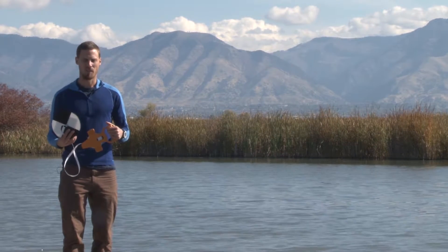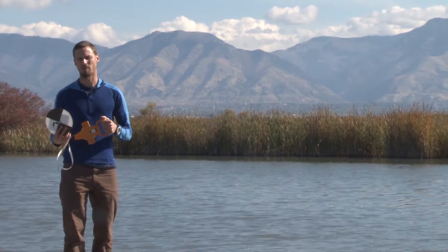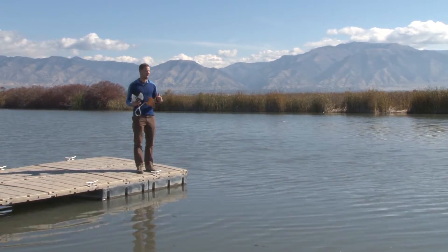It's really simple to do. The key thing is you need to have access to deep water. You need to either do this off a pier like we're doing here at Cutler Reservoir, or off a boat.